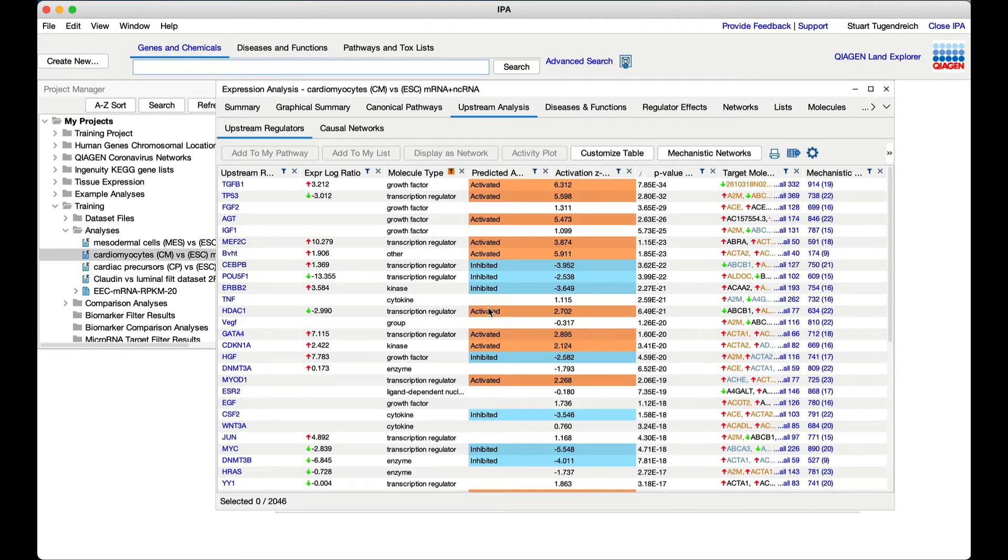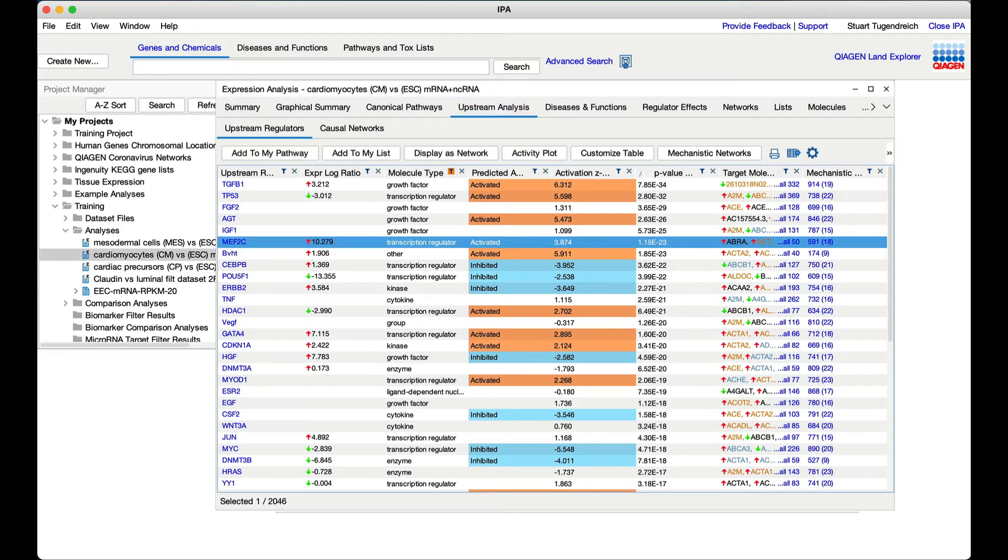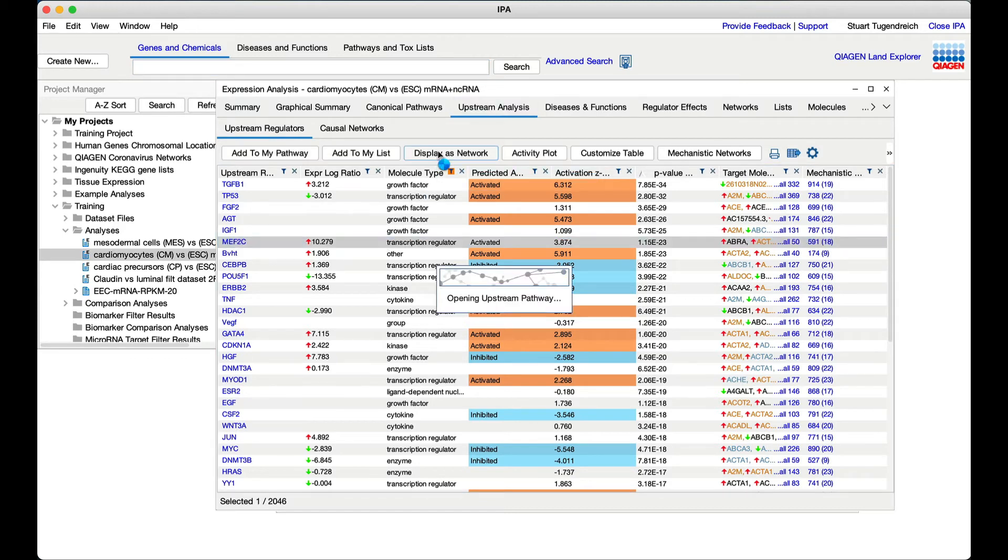Now, to explore an upstream driver in more detail, click on its row and then the display as network button.